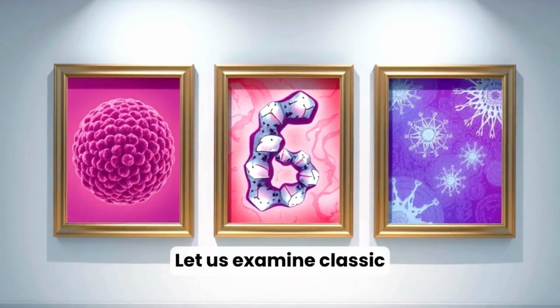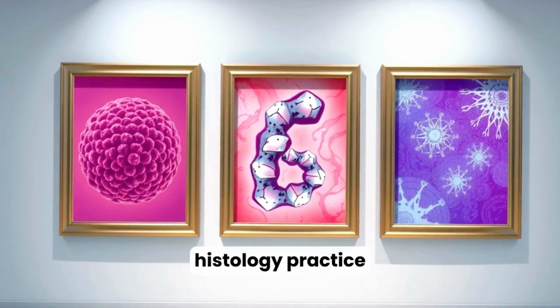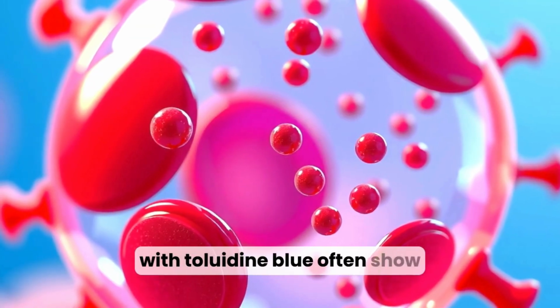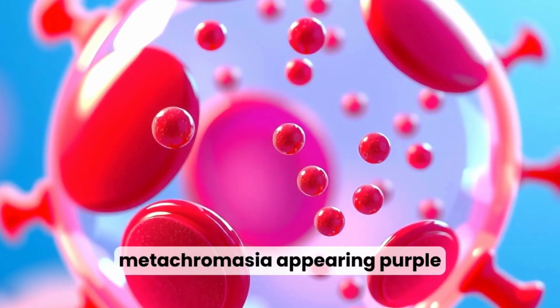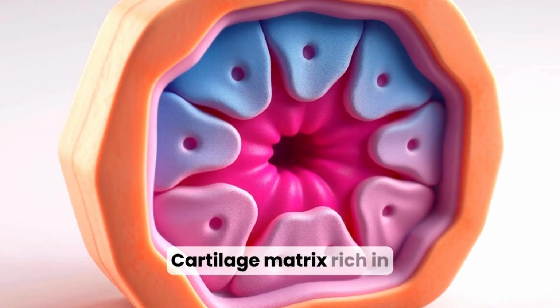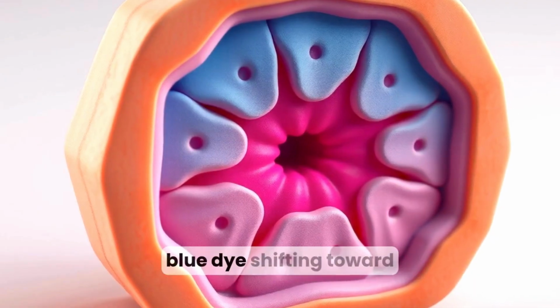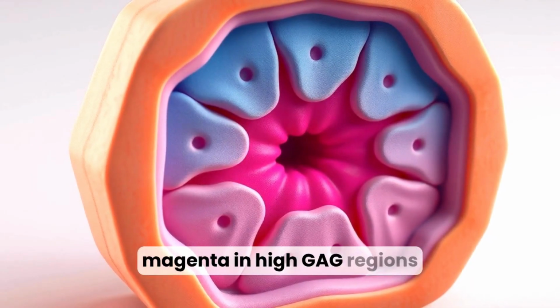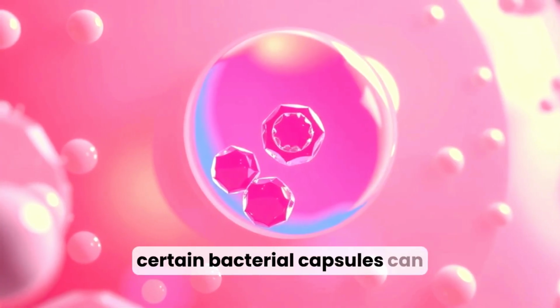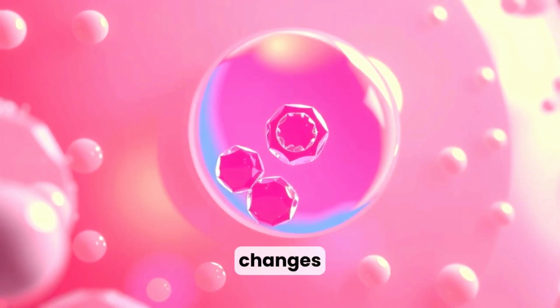Let us examine classic examples where metachromasia is routinely observed in histology practice. Mast cell granules stained with toluidine blue often show metachromasia, appearing purple or reddish despite a blue dye. Cartilage matrix rich in glycosaminoglycans also displays metachromasia, with blue dye shifting toward magenta in high GAG regions. Mucinous secretions in certain bacterial capsules can similarly induce dye aggregation and visible color changes.